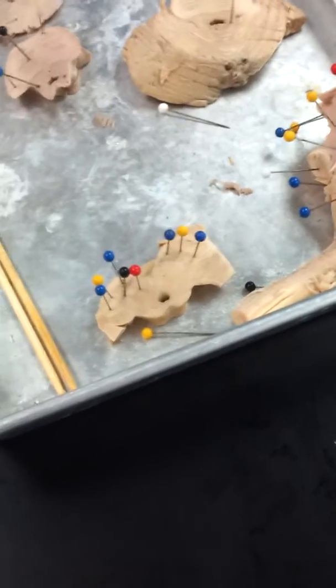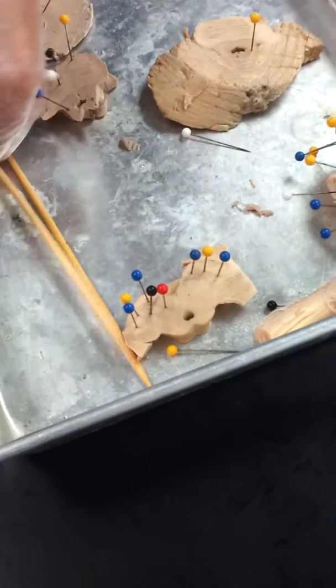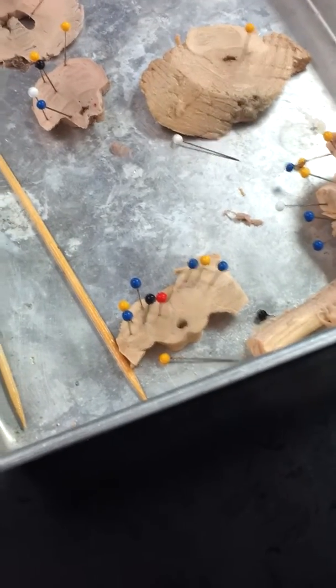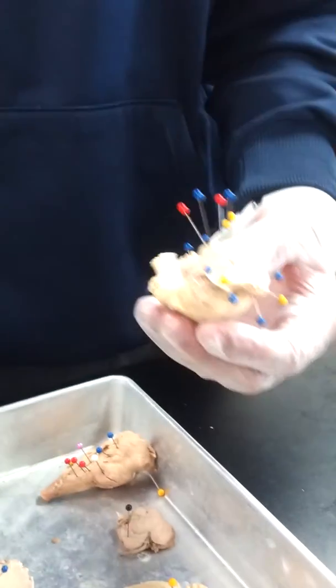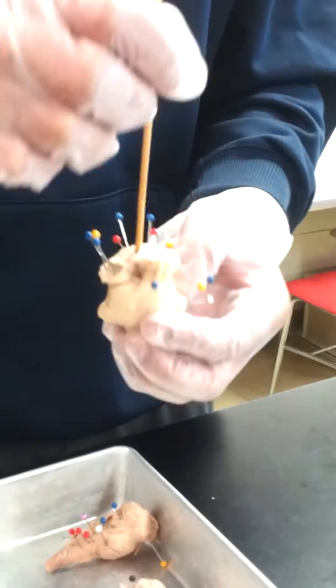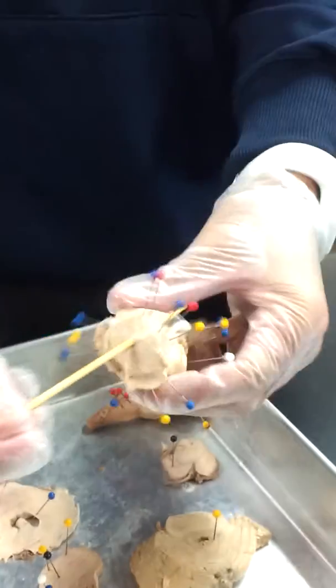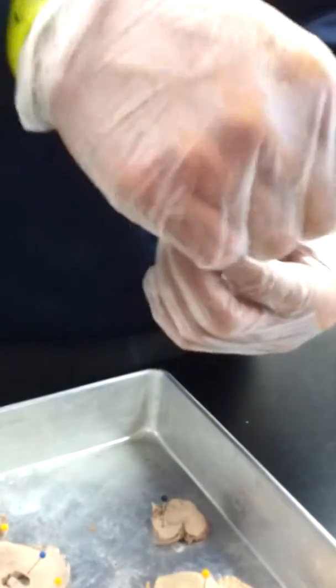What's CA? CA, cerebral aqueduct. Number 3. That's what you see here. This is the cerebral aqueduct inside. That's how you know you're in the dorsal side from the ventral side. So if you look here, this is ventral, this is dorsal. Dorsal, you'll be able to put your skewer through. The other one is more noticeable. This is the better one. Yeah, goes all the way in.